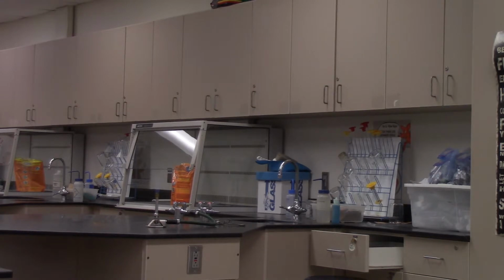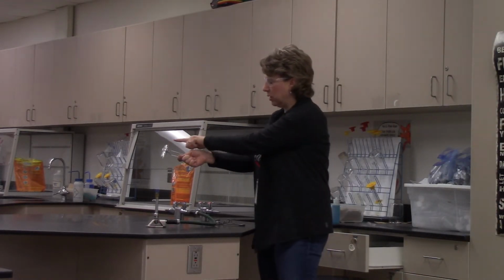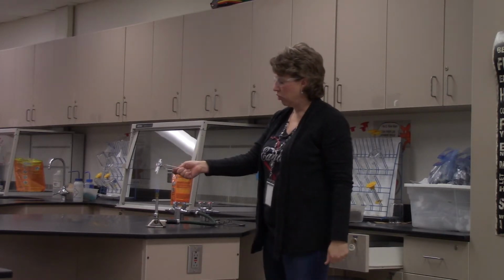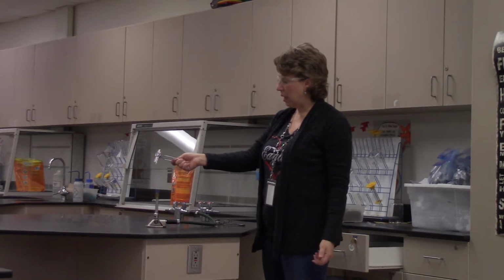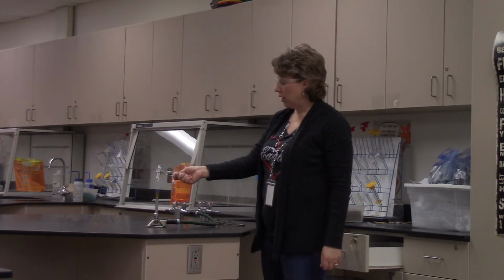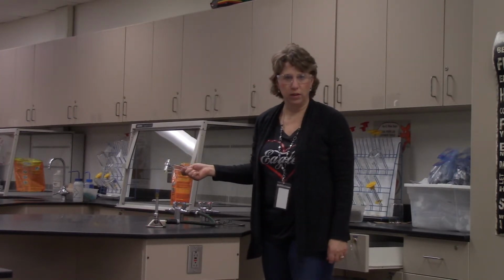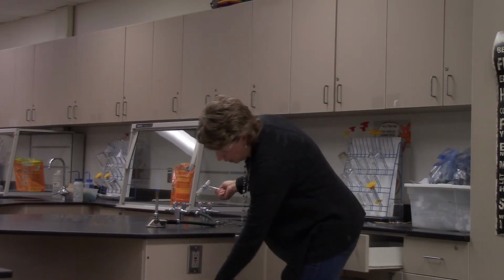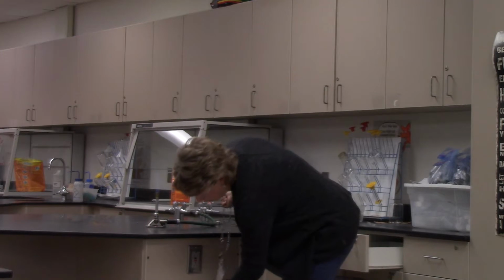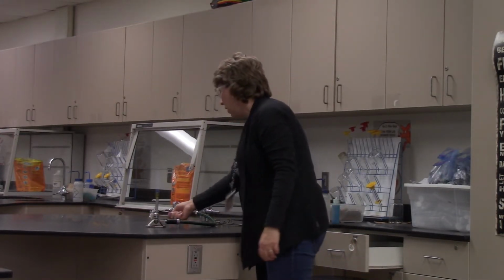And when I do this, I want to heat it gently at first and make sure the end is pointed away from anyone. So gently, and as I'm heating that gently, nothing is happening. So I'm going to try heating it a little bit more strongly, and I still have no reaction going on with this. Okay? At that point, remember this is a hot test tube, so do not put it back in your plastic rack. You can get out a trivet if you would like and put it on your trivet.